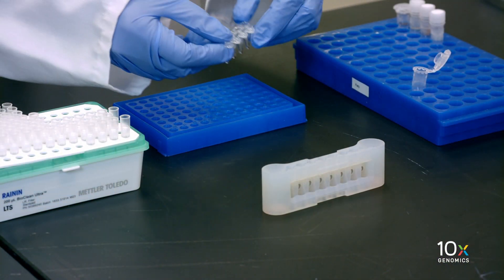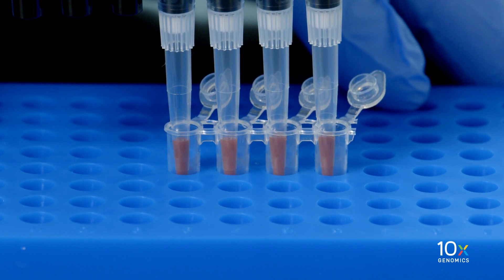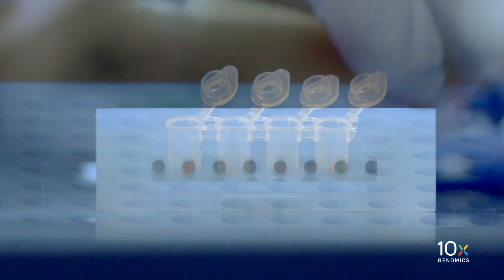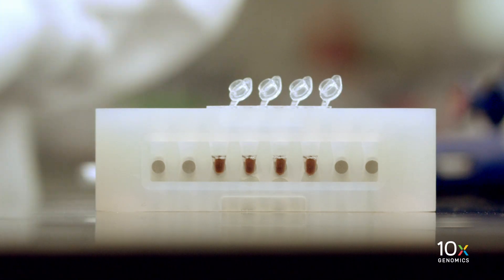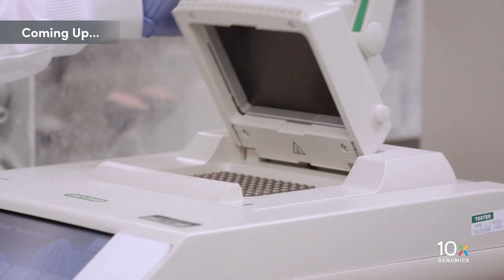Remove the tube strip from the magnet and immediately add Elution Solution 1. Pipette mix thoroughly with the pipette set to 30 µL until the beads are fully resuspended, and avoid introducing air bubbles. Incubate at room temperature for two minutes. Place the tube strip in a 10x magnetic separator in the low position until the solution clears. Transfer 35 µL of purified GEM-RT product to a new tube strip. We've completed our post-GEM-RT DynaBead cleanup and will next proceed with the cDNA amplification step.